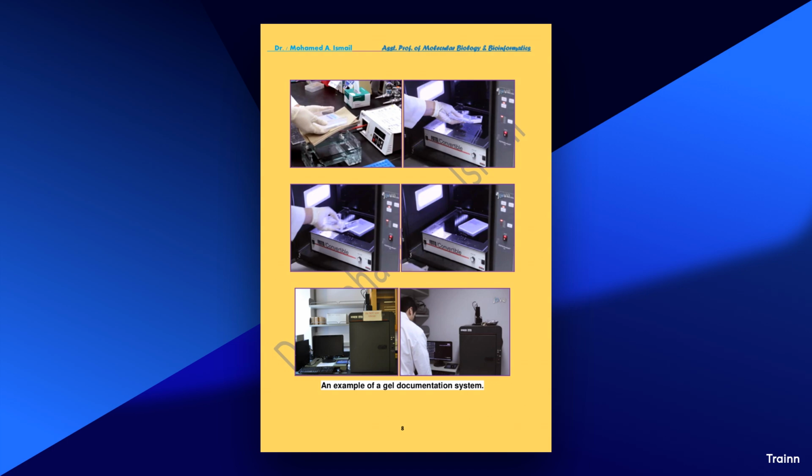Solutions: optimize primer concentration. Use a lower concentration of primers. Increase annealing temperature. Adjust the annealing temperature to enhance specificity. References: Nolan, T., Hands, R.E., and Bustin, S.A., 2006. Quantification of mRNA using real-time RT-PCR. Nature Protocols, 1, 3, 1559-1572. doi: 10.1038/nprot.2006.236.